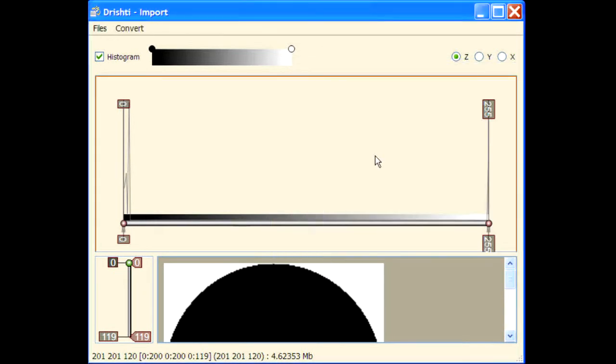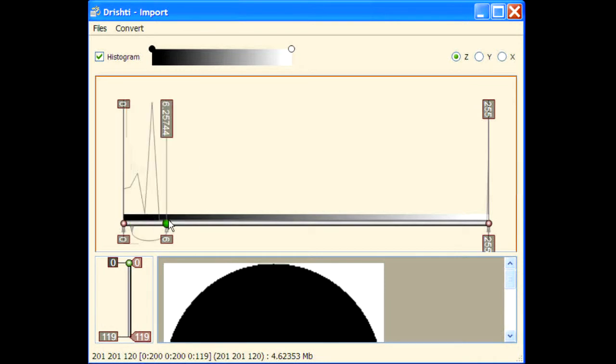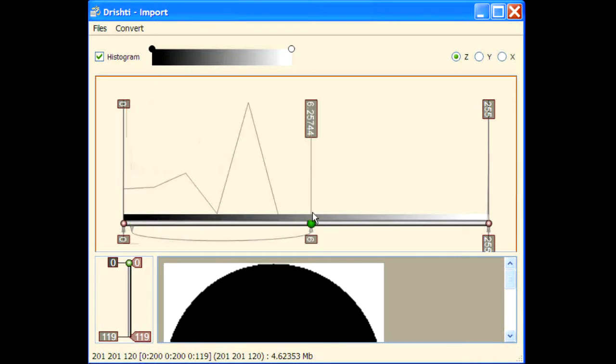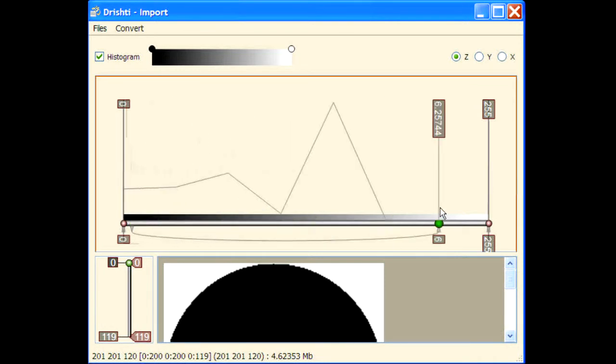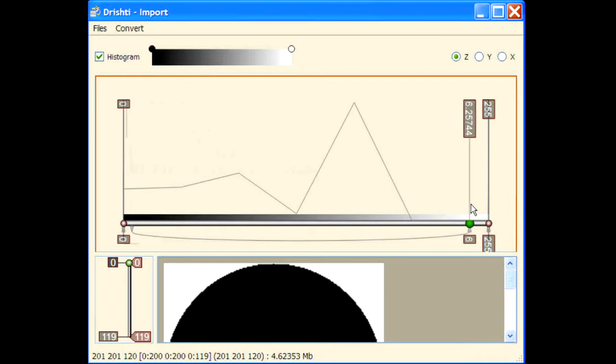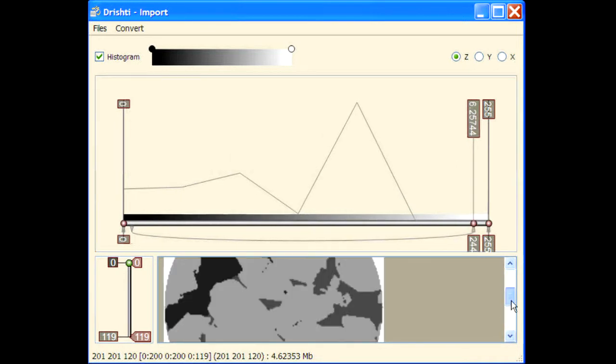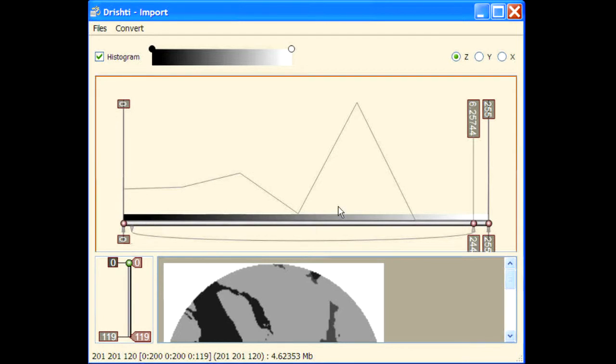Now this is your histogram. This is an unsigned char, so what we will do is we will just tweak this histogram so that these values are separated. Now you can see here, I have changed the histogram.